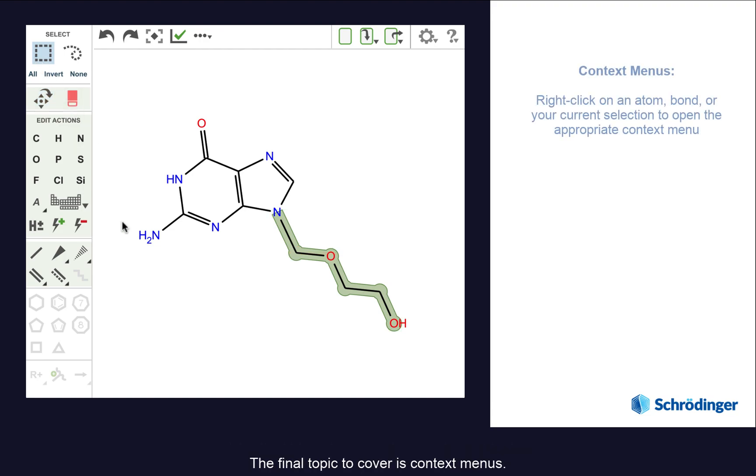The final topic to cover is context menus. Right-clicking on a single bond or atom opens the appropriate context menu. On a trackpad, you can use a two-finger click to open the context menu.